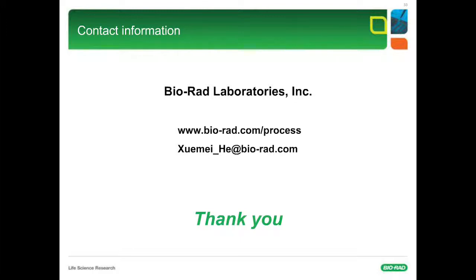One of the questions, actually from more than one person, is: when do you consider using an additive when you're using mixed mode chromatography? As in the examples I have shown you, firstly, I usually just look into the buffer pH and salt concentration. Only if these two conditions are not helping, we will try to add in additives.